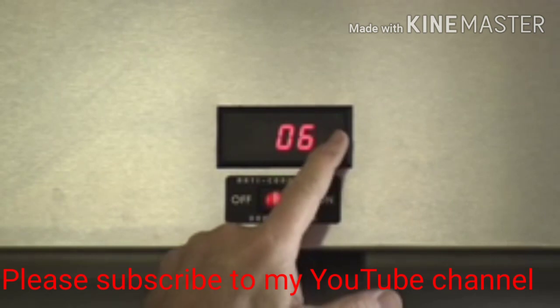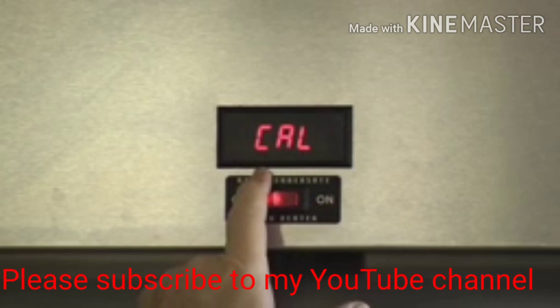You would go to the top of the thermometer, hit the right-hand center button, and you'll see CAL, which stands for calibrate.